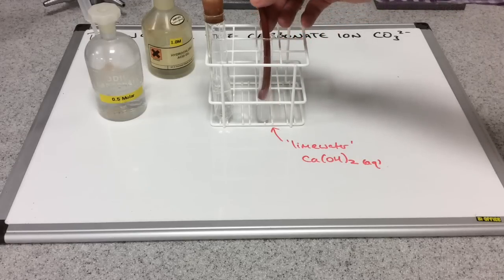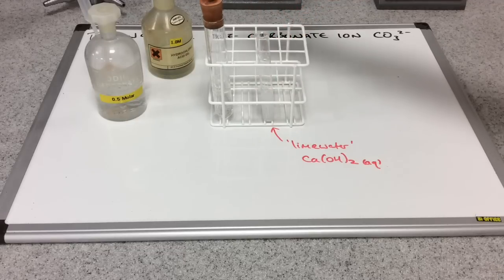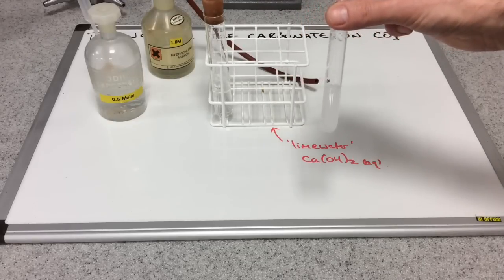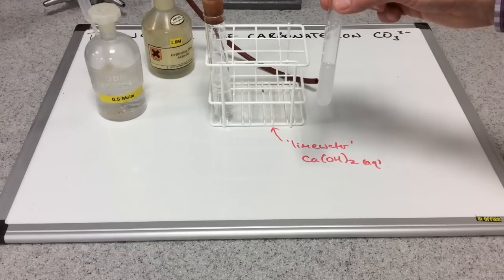So we'll just take the delivery tube out and show you the test tube now. You can see it's gone cloudy. So that's just confirmation that this reaction has produced carbon dioxide gas.